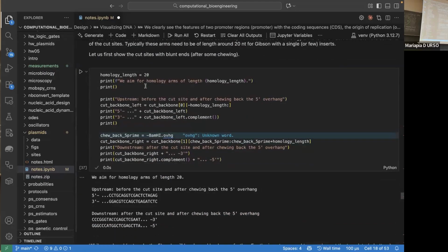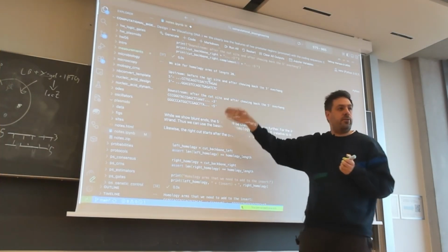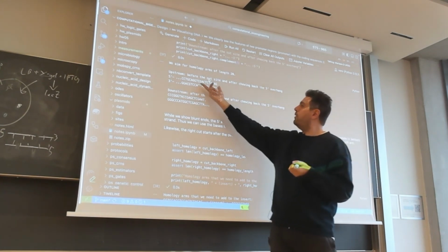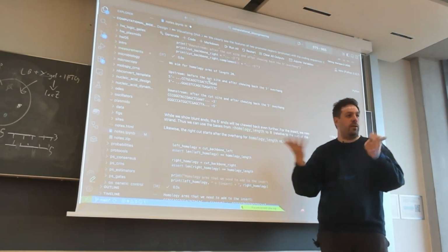So we kind of did the cleaning here. This is conceptually after the 5' exonuclease has eaten away the overhang. Of course, imagine the 5' exonuclease doesn't stop here at the blunt end; it continues eating inside. But computationally, it's nice to have a blunt end here because then you can easily take the complement from this as this, and so on. It's after making it blunt, kind of.